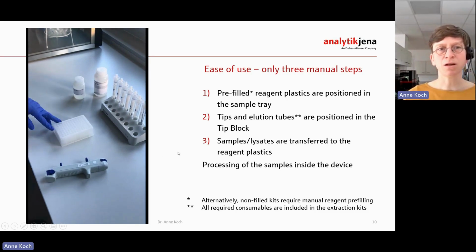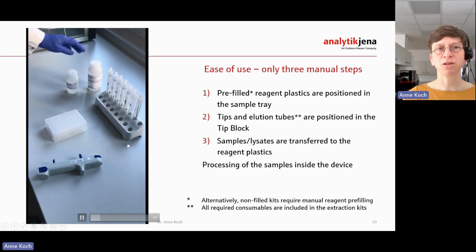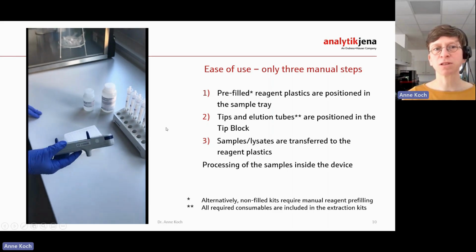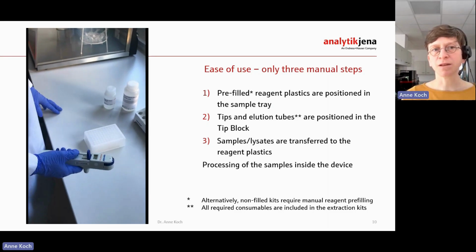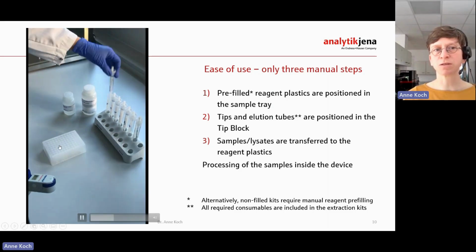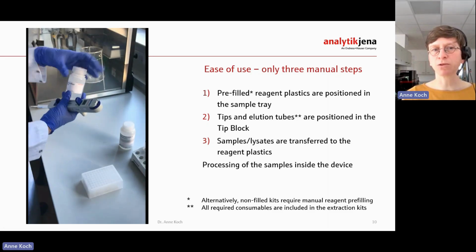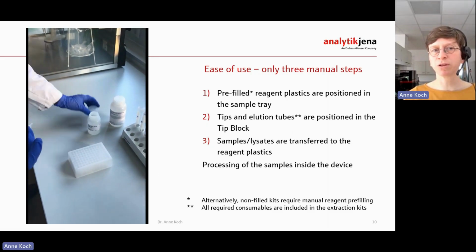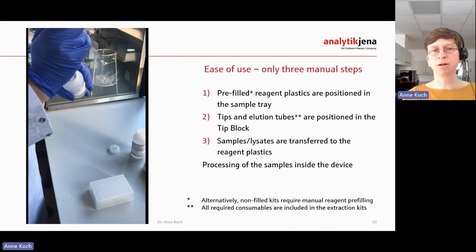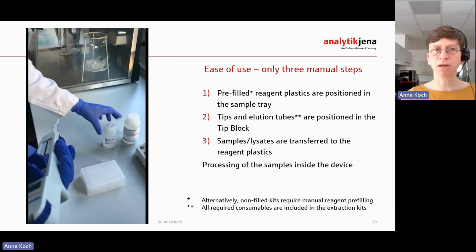So now, I will show in this video how to pre-fill it. I'm just again showing the bottles. Those are coming with the kit, of course. And then you can simply decide how many samples you want to process with this non-filled plate. You're very flexible, of course, with your sample number. If you only have 3 samples, you will only pre-fill the plate for 3 samples, and then you can reuse it later to process the other 5 slots on the plate.